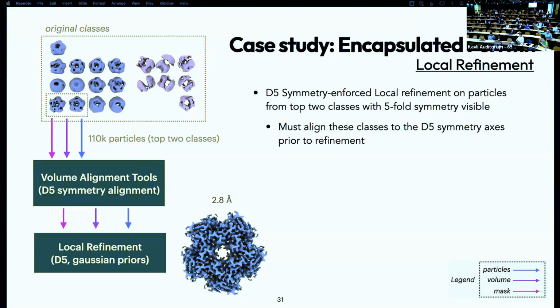I am probably not the most familiar with phase plates. I can start, but Ellie can take that one. So phase plates in general are definitely something that, from an image processing perspective, theoretically would be amazing and awesome, especially for tomography, but we can leave that as a separate topic. I'm sure with the laser phase plate, there are issues about actually building one and having one in your microscope that are a whole different can of worms. But in principle, if such a thing were to be able to be created and robustly used in image acquisition, it would make a big difference in a few ways.